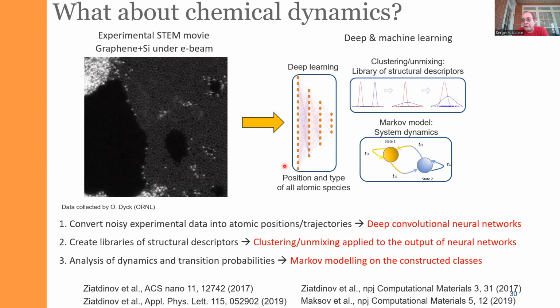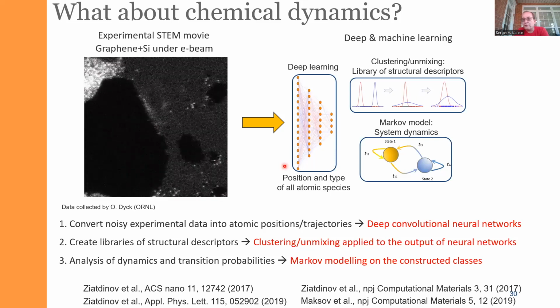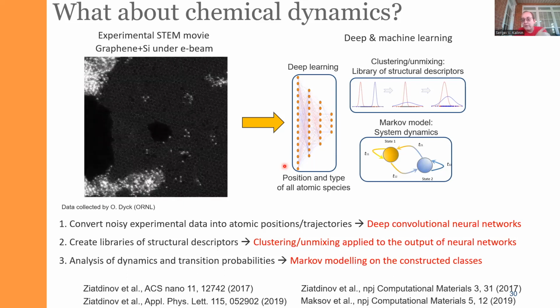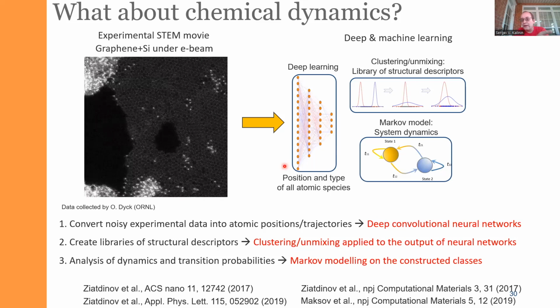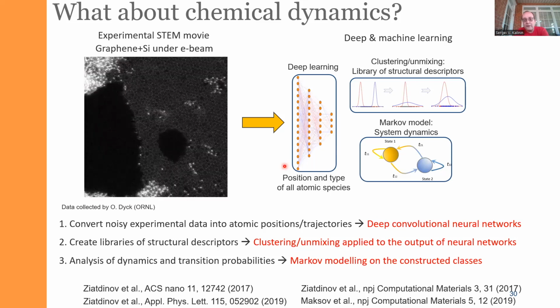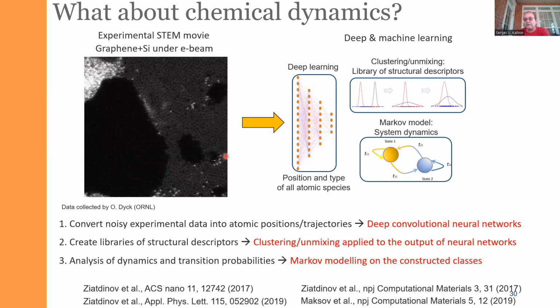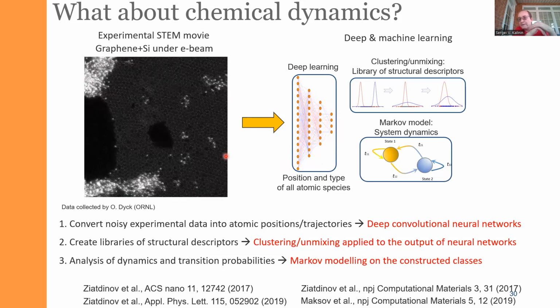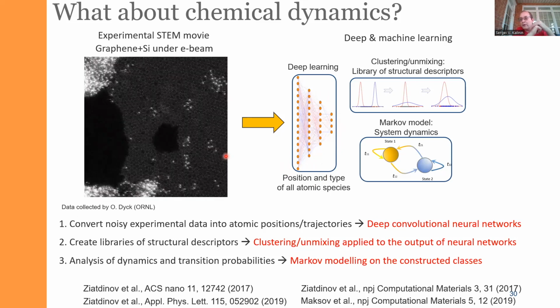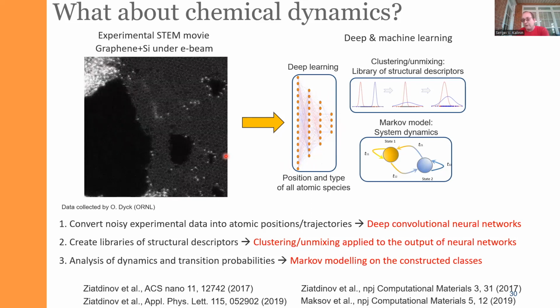For dynamic data, we have to be cognizant of the dose, because the larger the dose, the better we see atoms, but there is also higher damage to the material. This is the case where we typically use deep learning to find the atomic positions. The simple blob log type methods don't really work very well. But we will illustrate how it works in a few lectures from now.